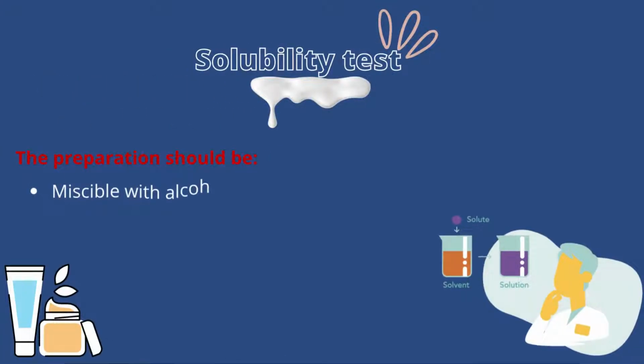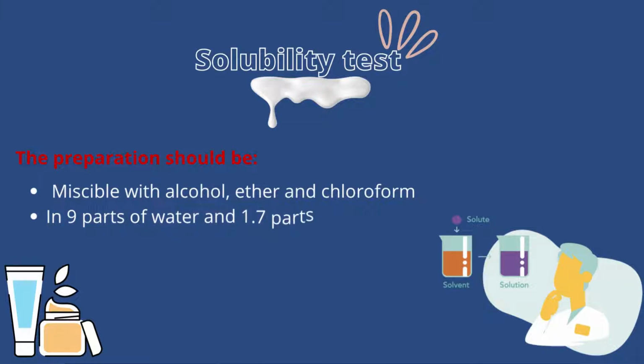Solubility test. The preparation should be miscible with alcohol, ether, and chloroform, and should be soluble in 9 parts of water and 1.7 parts of hot water.